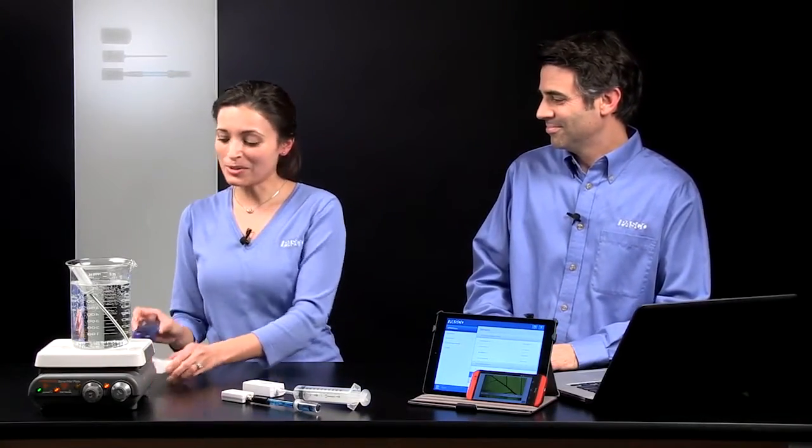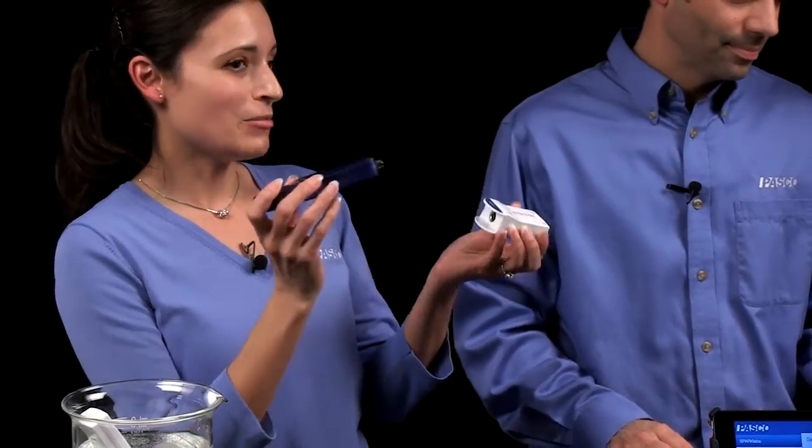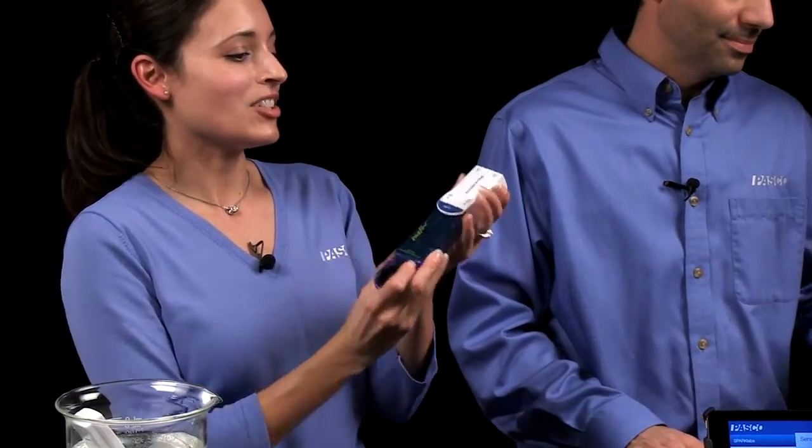So this is a great start to our wireless sensor line. But there are going to be other sensors to come that are going to address the needs that you have in your physics, in your chemistry, in your biology, and in your environmental classes. And for your sensors that you already have, you can connect an existing passport sensor to an Air Link and make it a wireless connection.